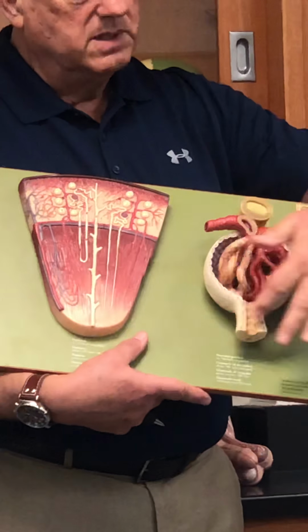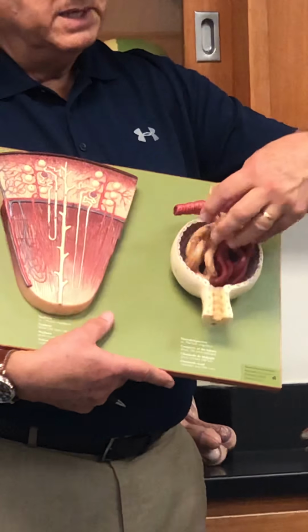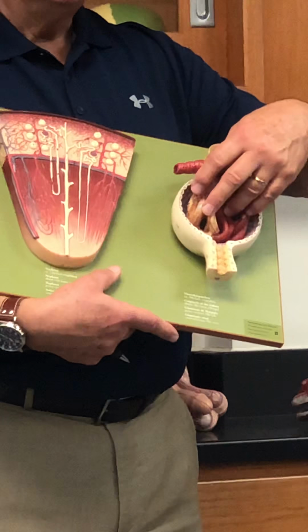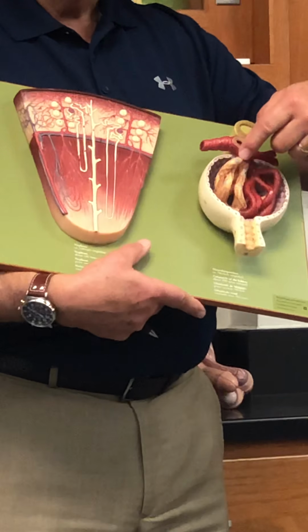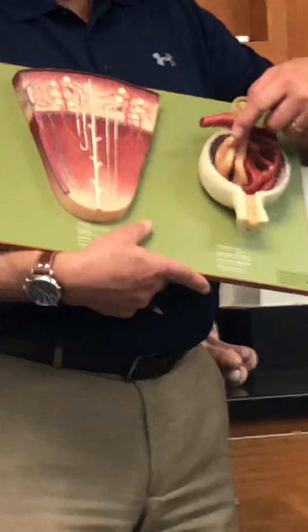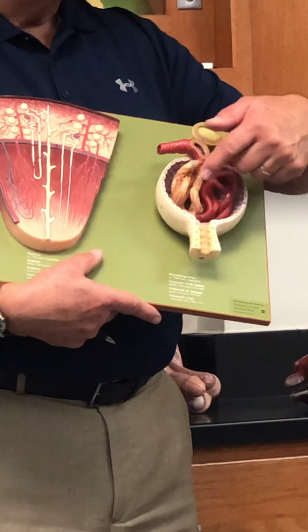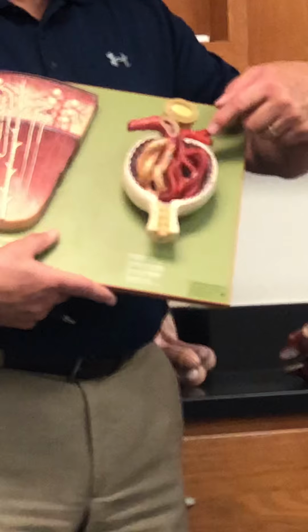Again, this is the renal corpuscle, and this part of the renal corpuscle is called Bowman's capsule. And on the inside, this is also part of the renal corpuscle, are these capillaries. What are these capillaries called? Glomerulus, right? On top of the capillaries, we have these specialized cells. What are they called? They actually control the filtration, called podocytes. So here comes the afferent arteriole. It makes its way here into the capillaries, controls the blood pressure, and then it makes its way out another artery. Efferent arteriole, that's right.